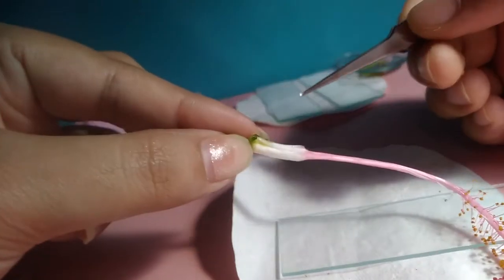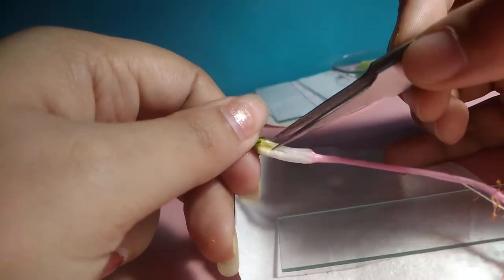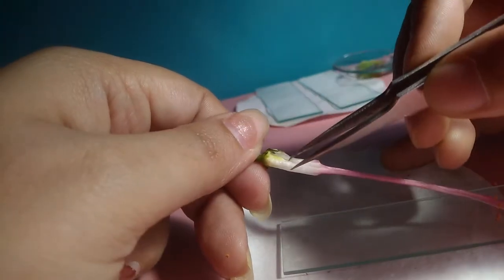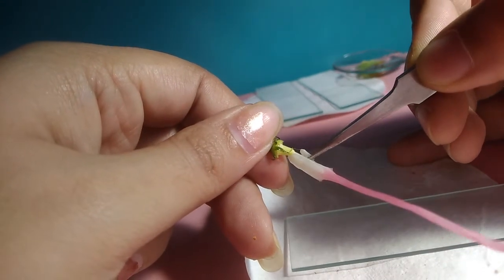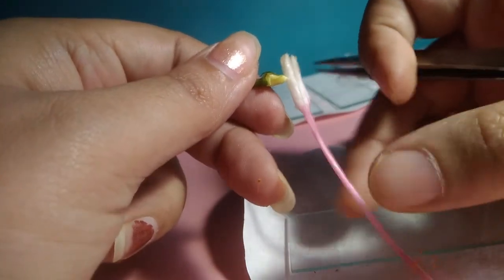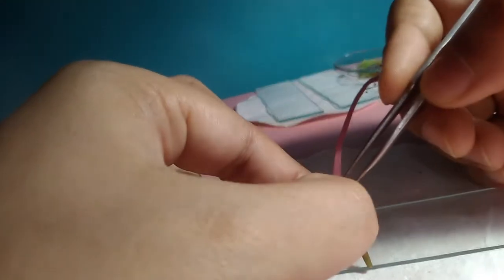Now let us try to open this ovary. Yes, our ovary is exposed. Now we will very, very carefully remove our stigma from this monadelphous staminal column.